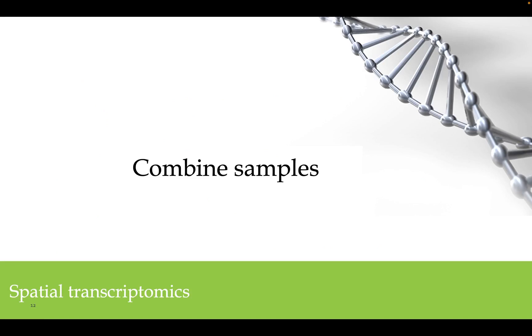In this video, we will cover how to combine multiple samples. After having normalized the samples, we need to combine them before running joint dimensional reduction and clustering. There are two methods available in Chipster for this: merge and integration.